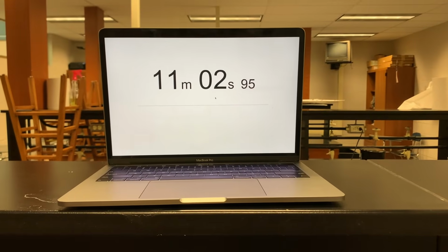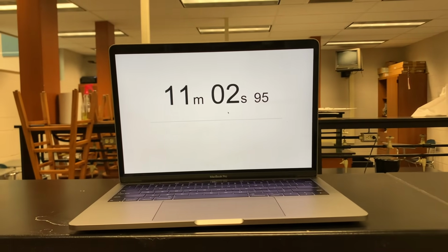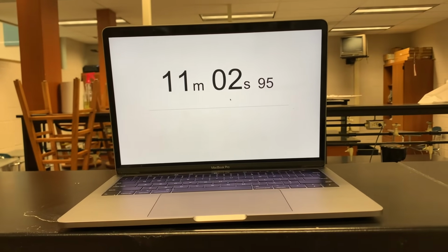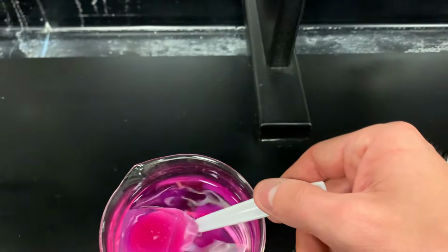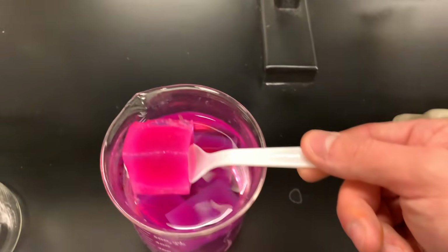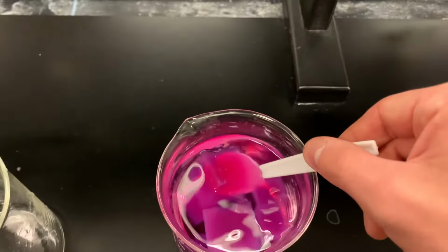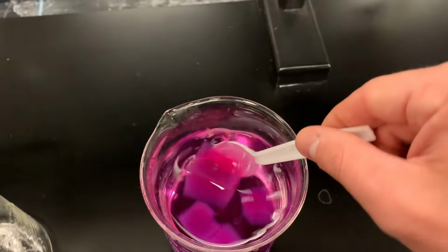All right, guys, so we left it in there for about 10 minutes. I did a little bit extra just because the middle of our cubes were still a little bit cloudy. They weren't completely transparent. So they are now completely done. So what I'm gonna do, guys, I don't wanna get this stuff on my hands. So I'm going to use a spoon and I just got a dissection tray, and we're going to transfer them over. Let them dry for a minute or two.